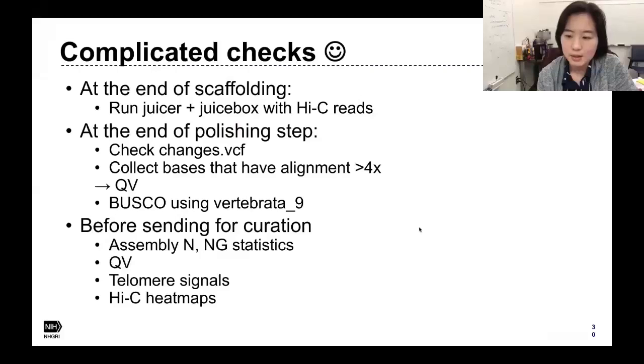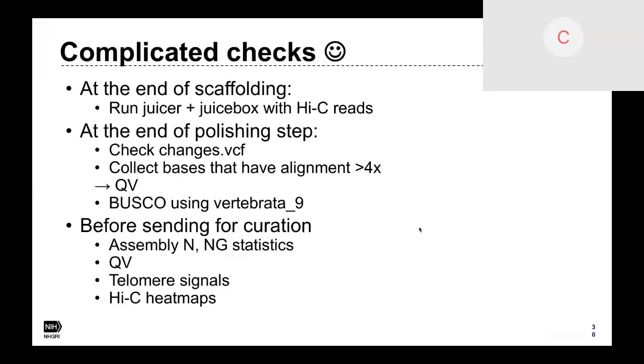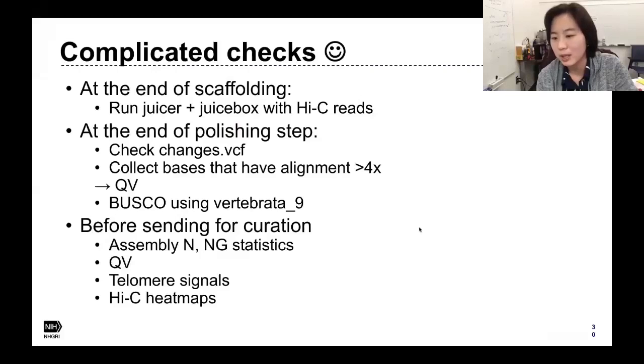So far, I have seen that Arrow is basically fixing or filling gaps that are the size of an indel. For most of the scaffolding gaps, for example the gaps placed by BioNano, which are over a megabase or something, those can never get touched. Only the gaps placed by Scaff10X, I think, were mostly targeted. Sometimes BioNano places gaps of a few tens of bases or something like that. Those kinds of gaps might get fixed, but it all depends on the sequencing and the read alignment.